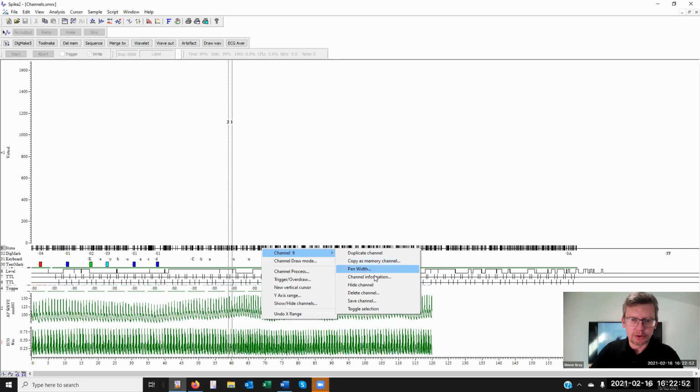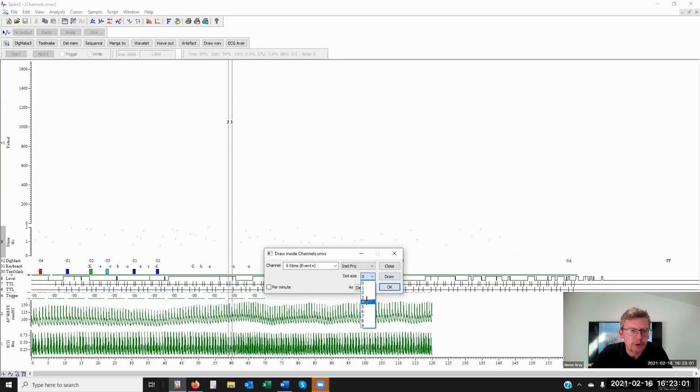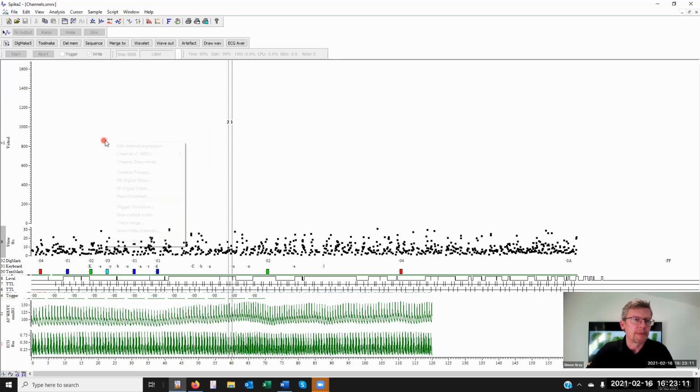Channel 9, we want to change the drawing mode. That's going to be instantaneous frequency, draw. Let's put dot size up a little so you can see it. Okay. And optimize. Okay, so a lot of data there.